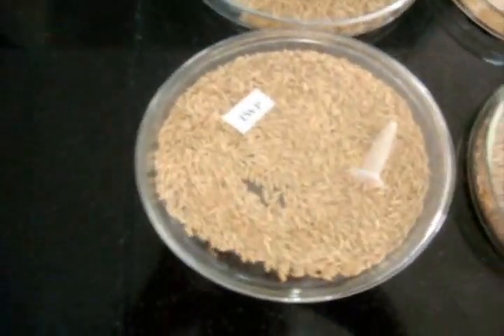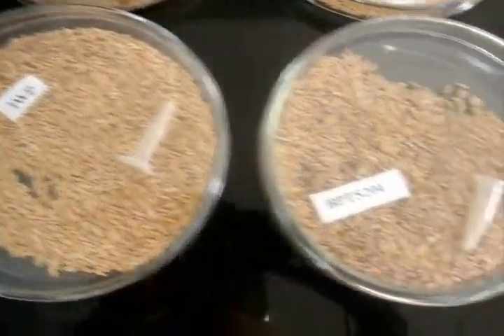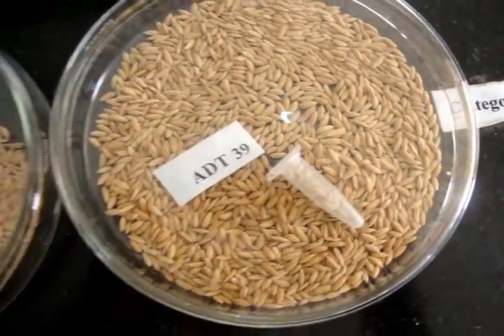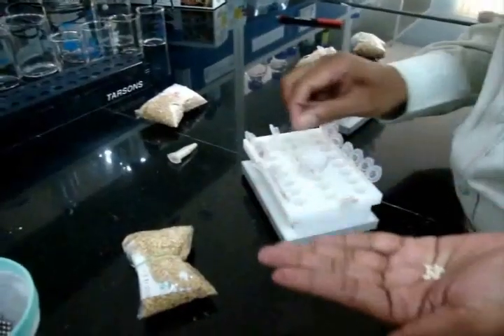The first step is sample collection. The sample should be collected from the commercial seedlot. After collecting the sample, it should be de-husked. Take only the grain part of the seed for DNA extraction, without the husk of the seed.